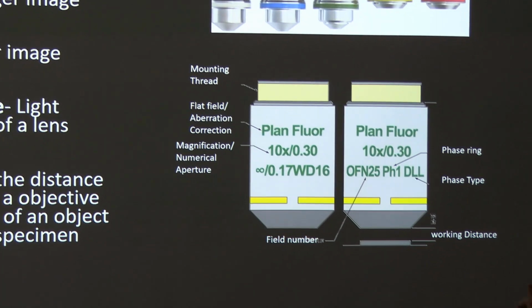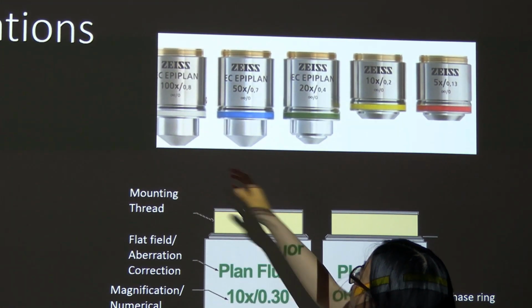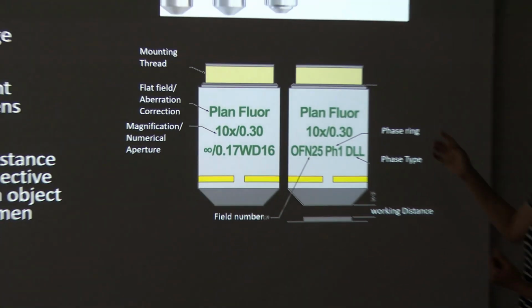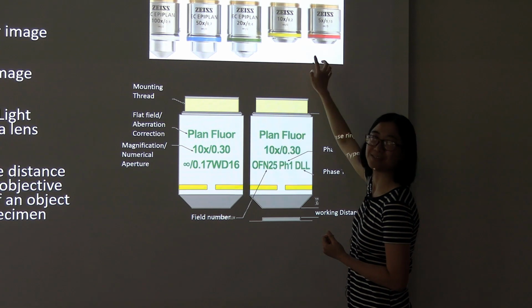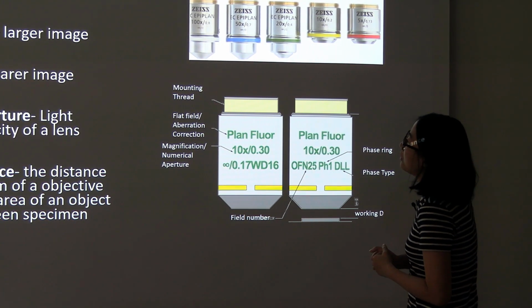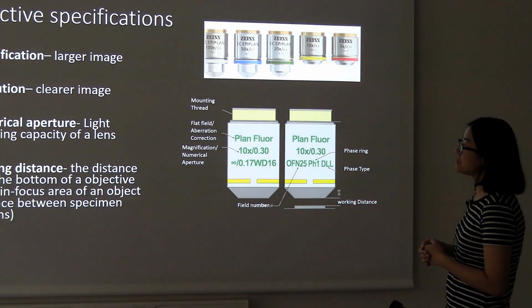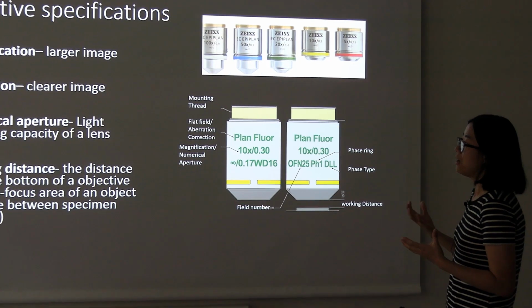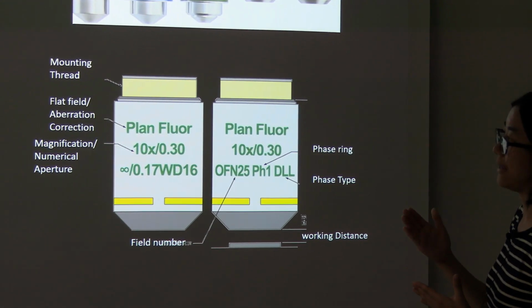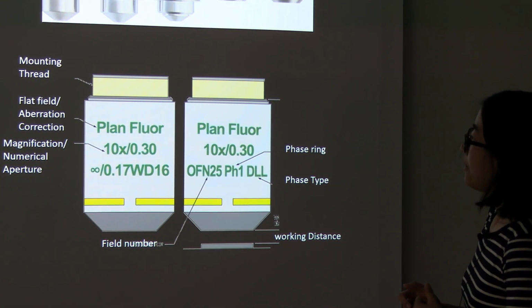So this could be distinguished by this color ring. For each different magnification size, you will find this marked with different rings. And so they also give the information of resolution. It's like with different resolution, you will have a clearer image or not.